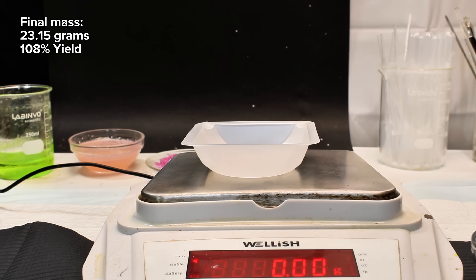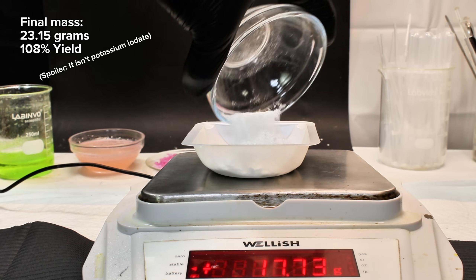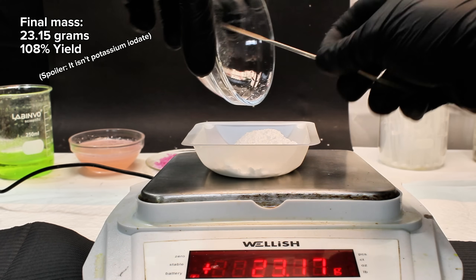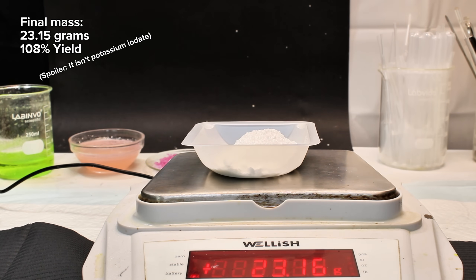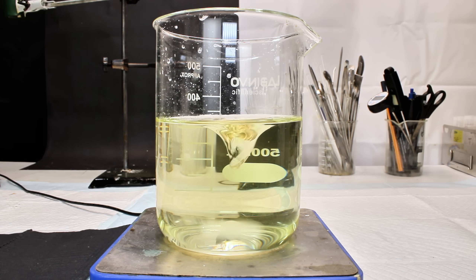I then weighed the potassium iodate for a final mass of 23.15 grams, representing an impossible 108% yield, which was slightly annoying. My idea here was that when potassium iodide and sodium bromate reacted, they would mostly form a mixture containing iodate, bromide, potassium, and sodium ions.